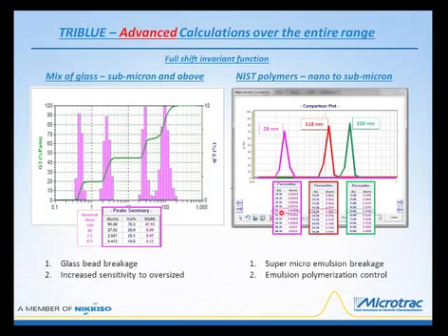And this is the 50th percentile for that material, the 50th percentile for the 110, and the 50th percentile for the 220. Unfortunately, this is off by about 0.5% for the 110 nanometer. But I think that is just a very small difference when you consider the 28 nanometers and the others are identical to what NIST is providing for that data.